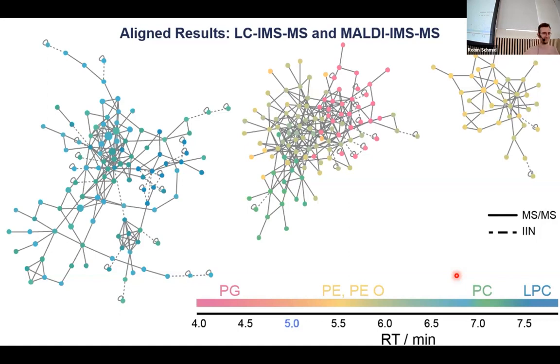And maybe, if someone already had some great experiences also, I mean, we use it in Uwe's lab in Münster also, and we had some great experiences of tuning the instrument to the last, and then really separating some different isomers, maybe even where the protonation sites on the molecule, you can sometimes even tear apart and see that there's multiple different ways how to protonate a molecule. And that can be very nice, and it can be just a lot of duplication of problems. Yeah. So, but yeah, we were definitely able to find great ways to separate compounds with it.